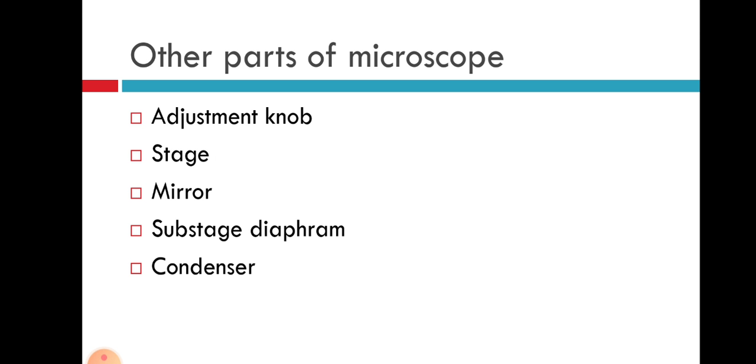The next part of the microscope is the mirror. The mirror reflects light which is transmitted through the object for observing it. The mirror has two planes, one concave and the other plane. When natural light is available, the plane mirror may be used for reflection of the light because the concave mirror would form window images. However, with artificial illumination, the concave mirror is necessary for higher magnifications, whereas for lower, the plane mirror may be used.